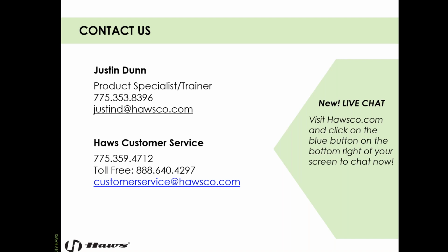If it's a substance that doesn't have an SDS, like there's no SDS for dirt, but if you got dirt in your eyes, I would still suggest 15 minutes, basically. I mean, we're talking about your vision, something that would be life altering if it were actually damaged, and we really need to make sure it's all the way out of there. So I always stick with 15 minutes as a bare minimum. But check that SDS sheet.